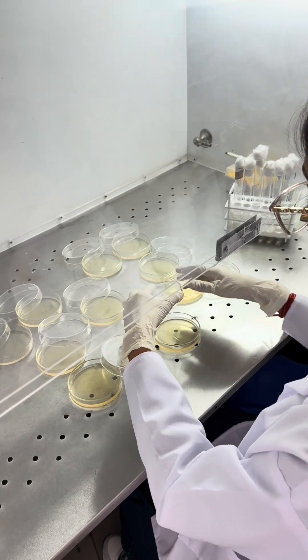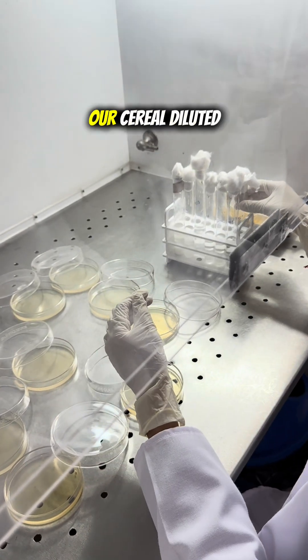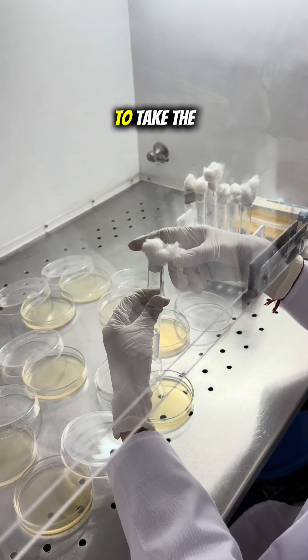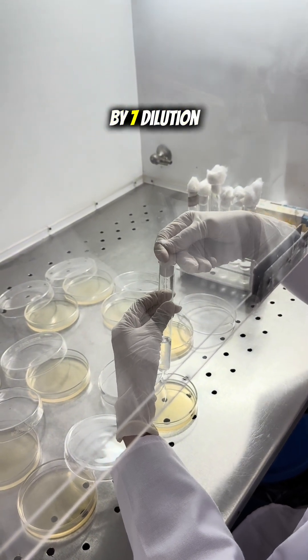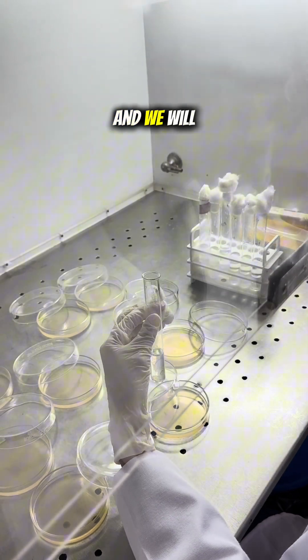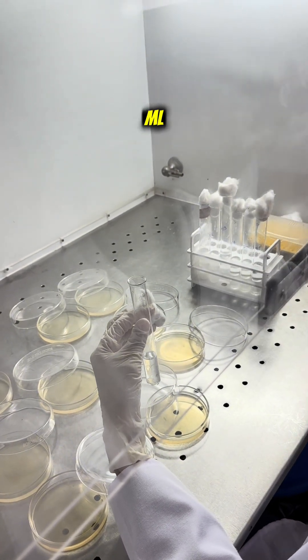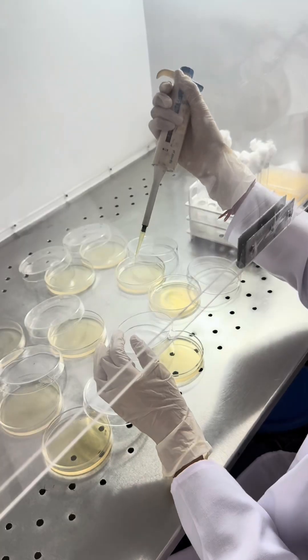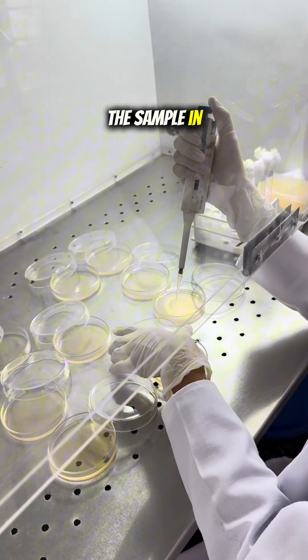This is our serial diluted food sample. We are taking the sample from the 10⁻⁷ dilution. As you can see, we will be using a micropipette and we will take 0.1 ml and spread it in the petri plate. Now let's add the sample into the petri plate.